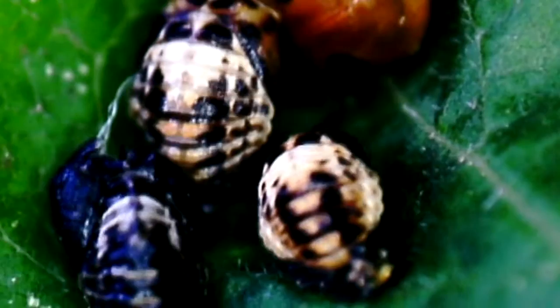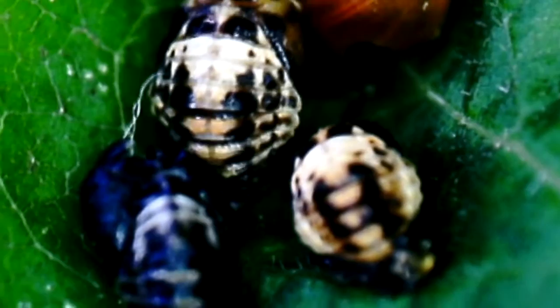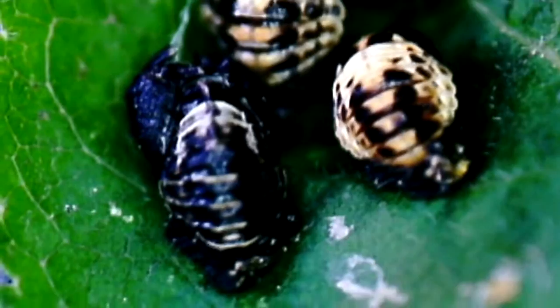These are ladybird larvae and they're pupating, and one's already emerged as a ladybird — or if you're in America, a ladybug. These look like two spots, but this is the pupal stage, and again recorded on the same microscope.